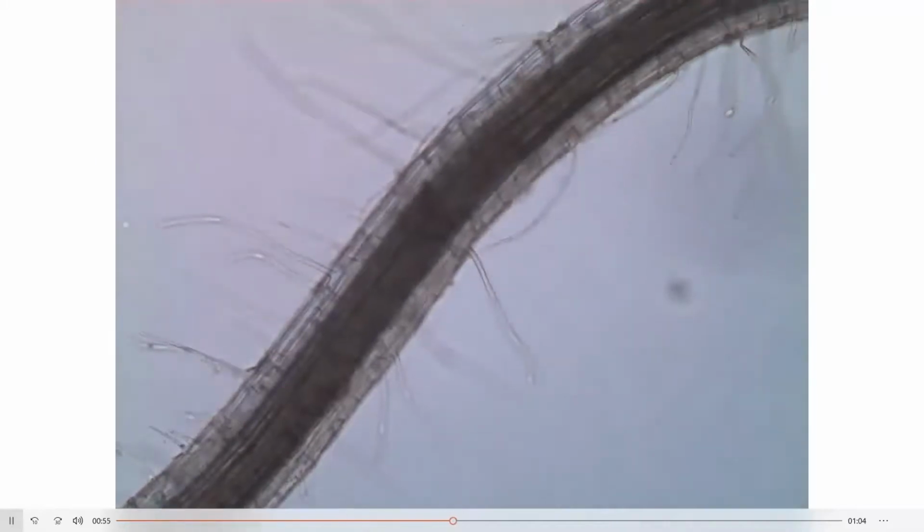The reason why it's not centered is because the little program I'm using to capture the video off the microscope, for whatever reason, moves it from the center of the field of view. But there you can see some of the root hairs. And I think I'll pause it here in a second.